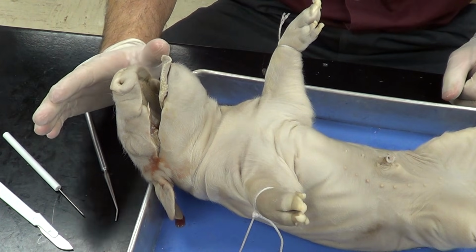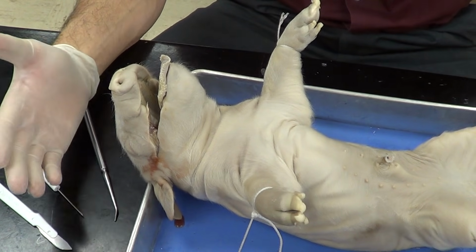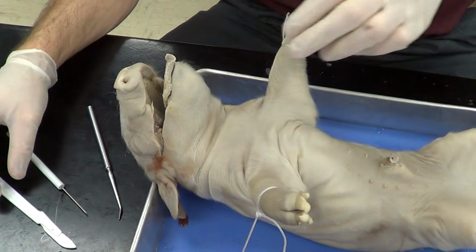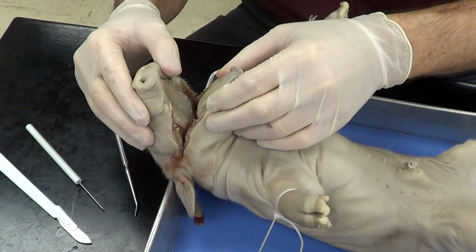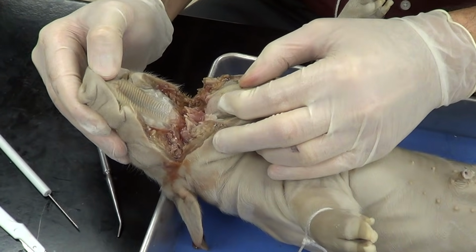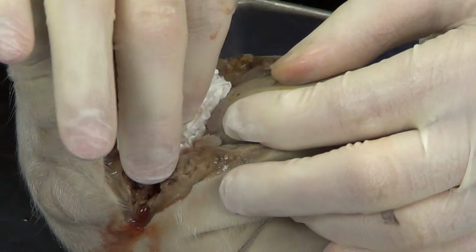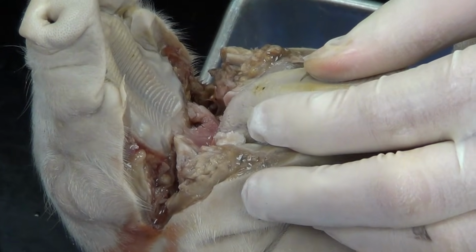Now the good thing is that the fetal pig has not really ossified. The bones have not turned to bone yet. They're mainly just cartilage, so you can cut through them relatively easily. I've already done that here. I've made my cuts and I've pulled open the mouth a little bit. I'm going to pull open the mouth a little bit more. And I'm going to take a paper towel and dab it in there and get rid of any excess liquid so we can visualize the structures a little bit better.